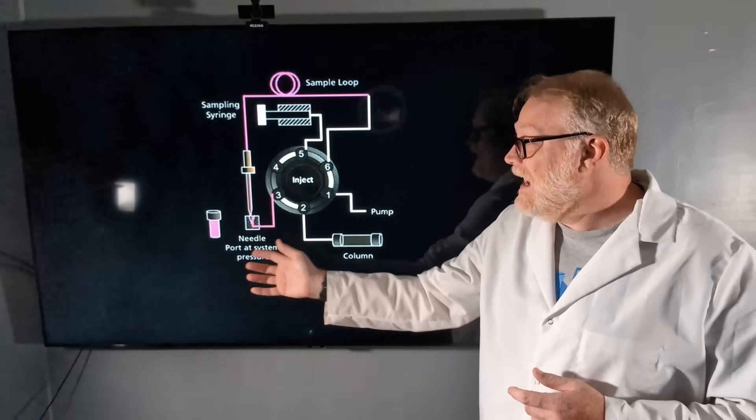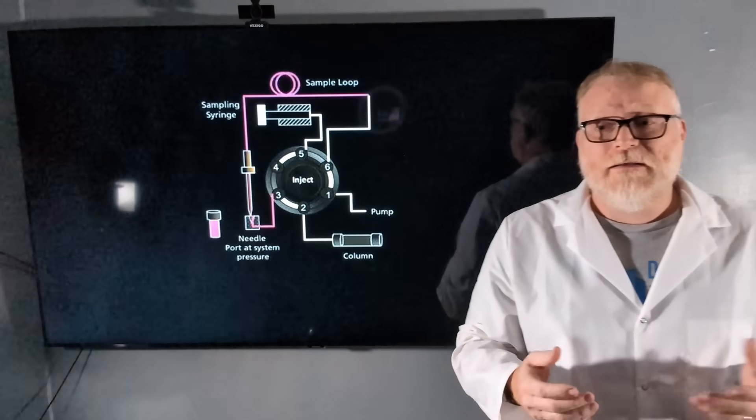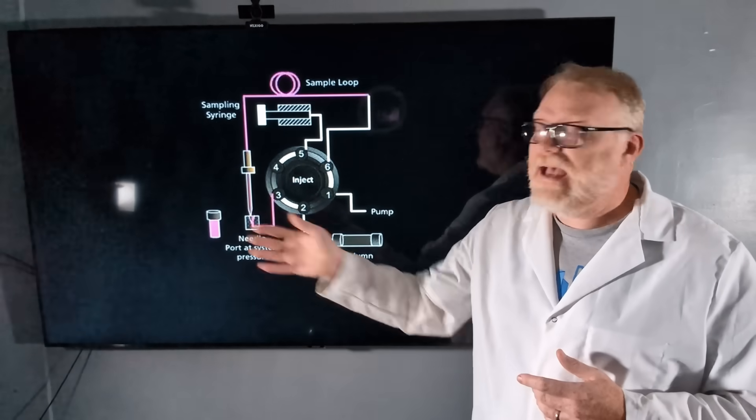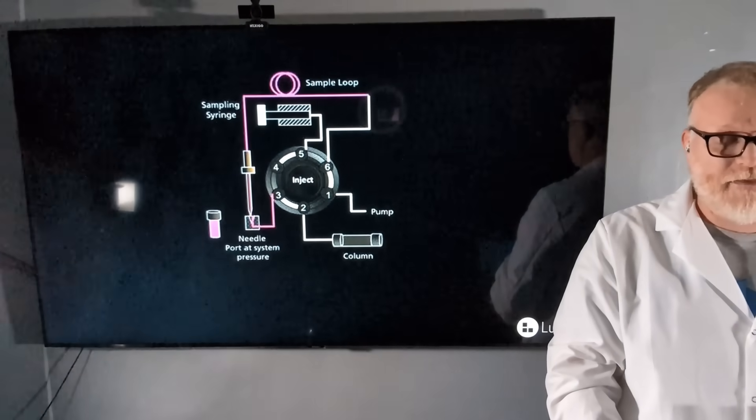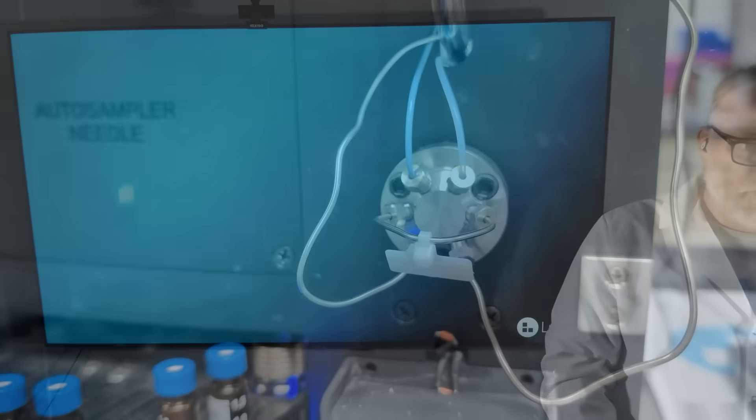This needle seat is now a leak point, which may be something to look at in case you notice that your pressure in your HPLC is dropping. So that's something that we would take a look at.